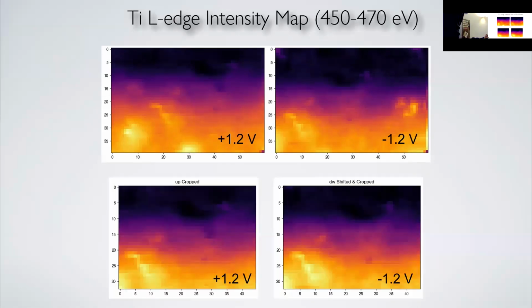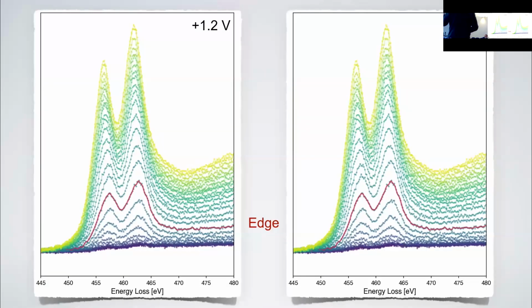And once you have something like this, then you see that they are on top of each other for the different voltages. And then what I care about is integrated along the x-axis, and I see how the intensity of the EMCD signal changes as a function when I go into the field. This is the spectra as acquired for the 2 different voltages. And then what I'm going to show you is the subtraction of this minus this, as I showed you before.